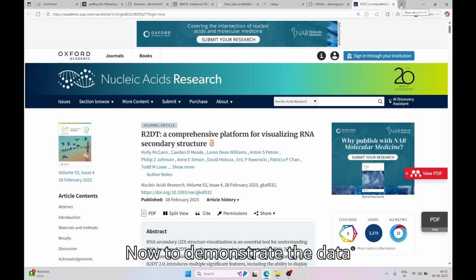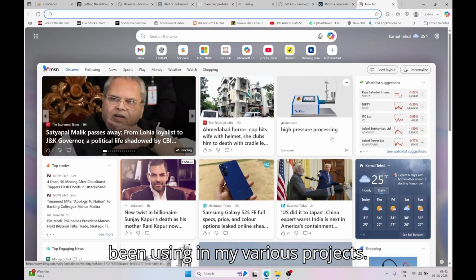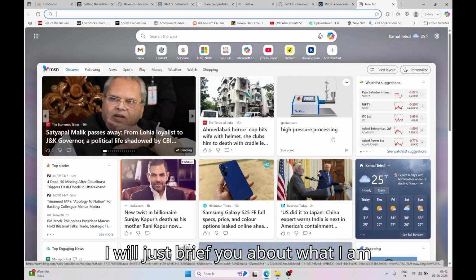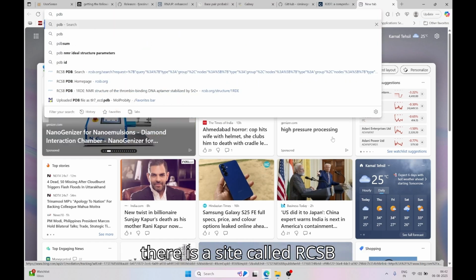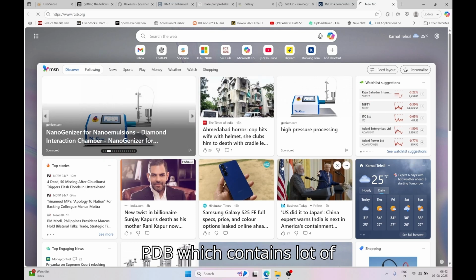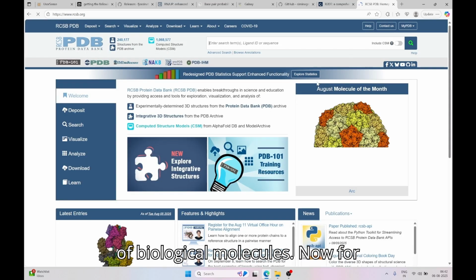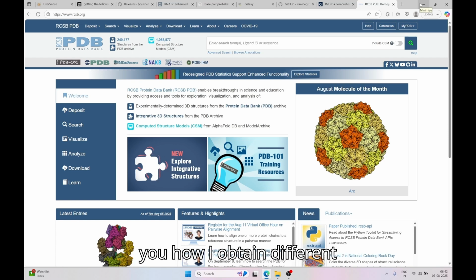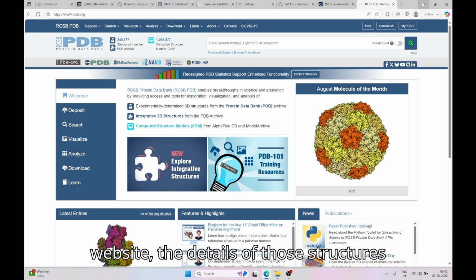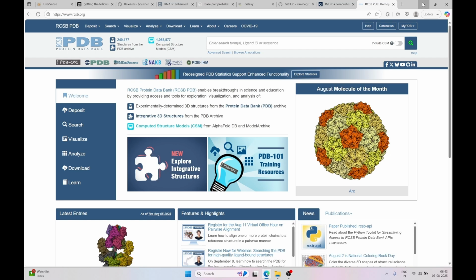Now, to demonstrate the data analysis which I have been using in my various projects, I will just brief you about what I'm going to show you in this video. There is a site called RCSB PDB, which contains a lot of information regarding the structures of biological molecules. For this particular video, I'm going to show you how I obtain different structures from the PDB website, the details of those structures, and how I use them for my data analysis.